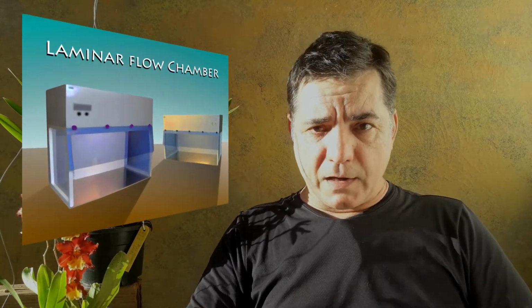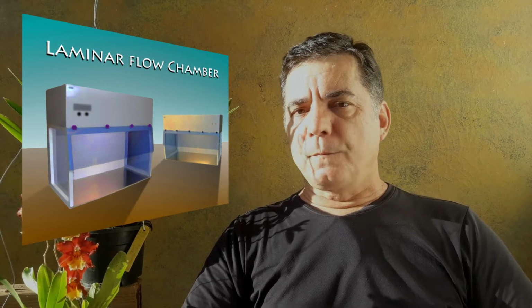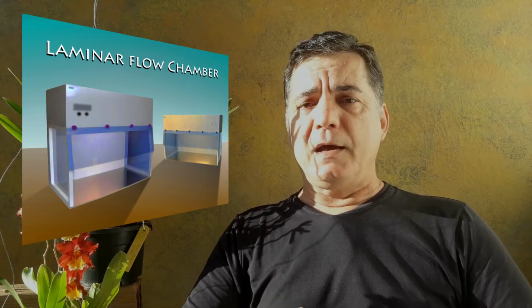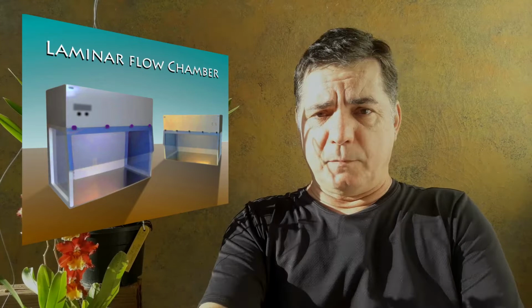Commercial orchid nurseries have laboratories equipped with a laminar flow chamber. It is a large glass box, which kind of reminds me of a donut display. It blows sterile filtered air inside of it, forcing an outgoing flow of clean air that prevents dirty outside air from getting inside. It is very convenient, but the price is off limits for the amateur, and a disproportional investment if you're going to sow only a few jars per year.